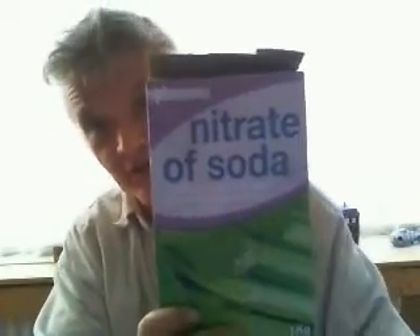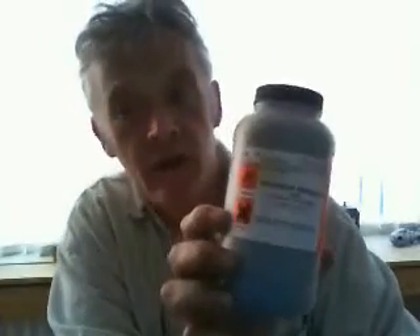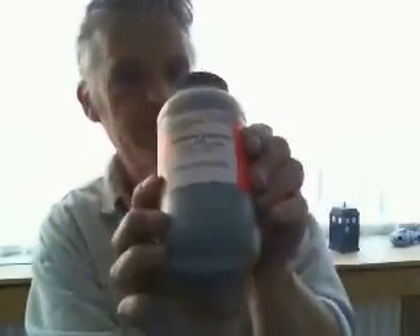You're going to need some Nitrate of Soda — this is a fertiliser, you can get it from a garden centre. You're going to need some Potassium Permanganate; you can buy this in little brown glass jars at a local chemist. And the next thing you need is some Graphite — I got this online because I've been doing quite a bit of work with graphite.